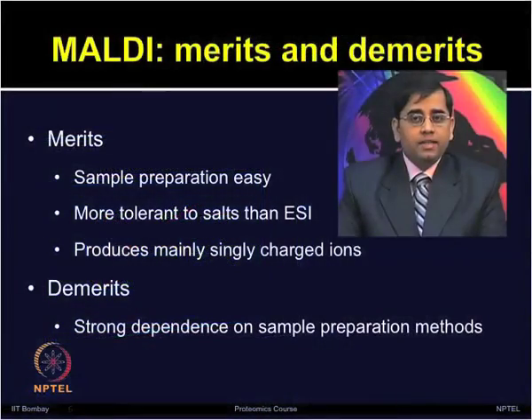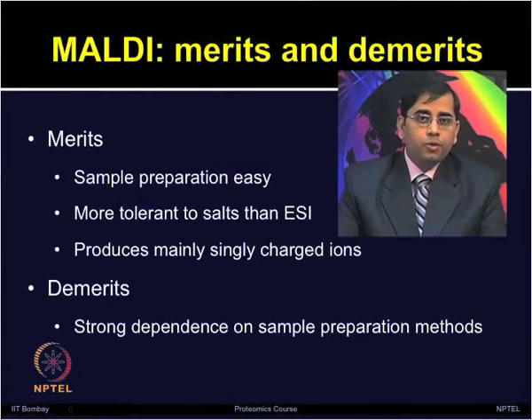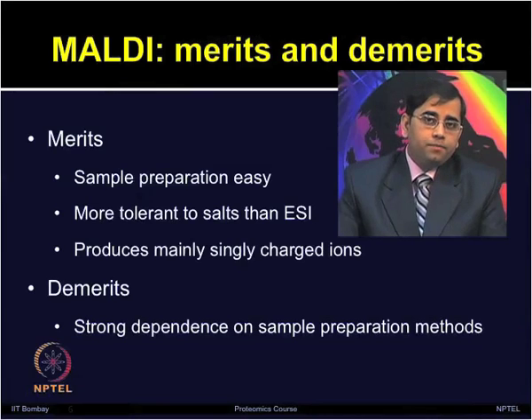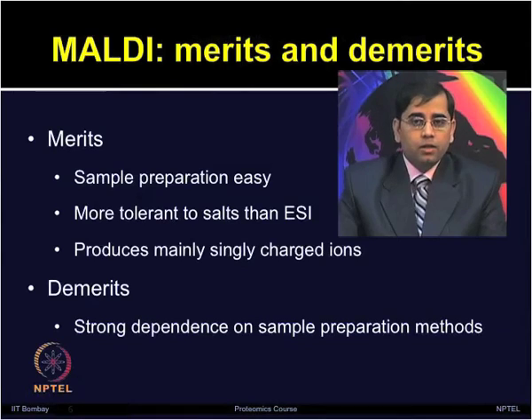Now the various advantages and disadvantages of using MALDI as an ionization source. The sample preparation is very easy. MALDI provides high tolerance to salt as compared to electrospray ionization methods. MALDI produces single charged species. Most analytes can accept a single proton.